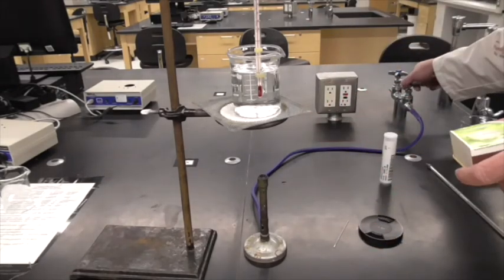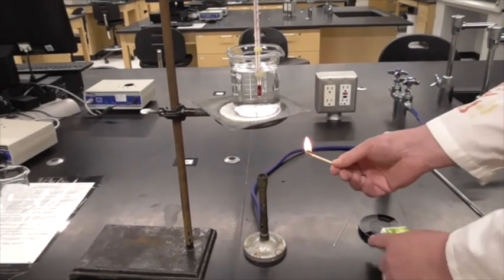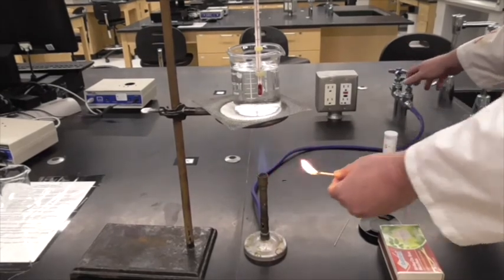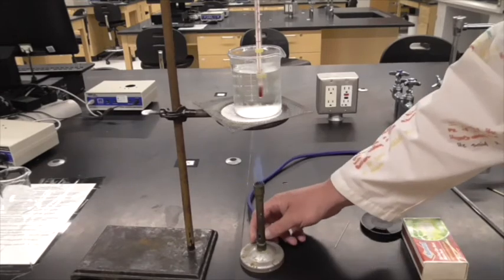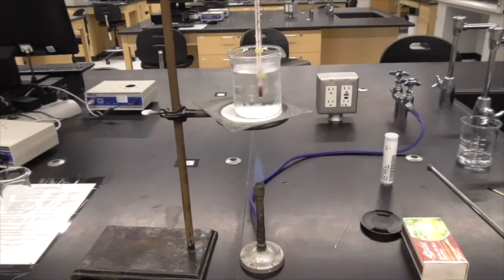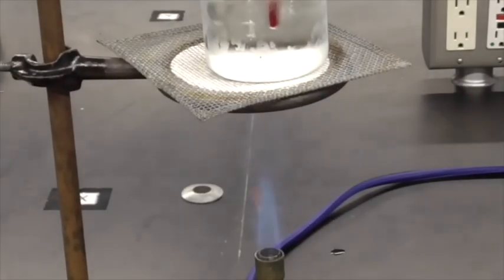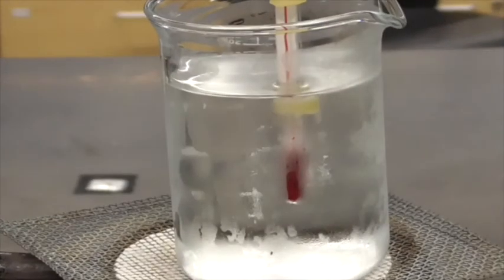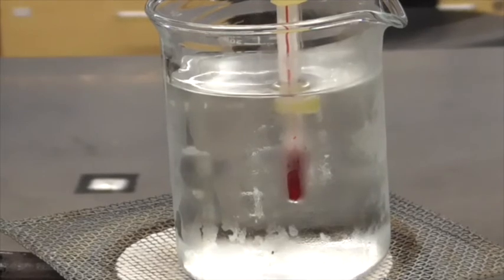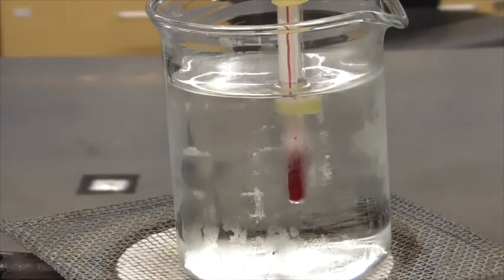Okay, so I'm going to light the gas here. There we go. And we're just going to let it heat up. You can see the condensation on the water already. You don't really need to see the flame. You can see it's condensing on there, and as the water heats up, that will disappear, and we'll have a better view of the sample. All right, so I'm going to zoom you into the thermometer so you can watch that.